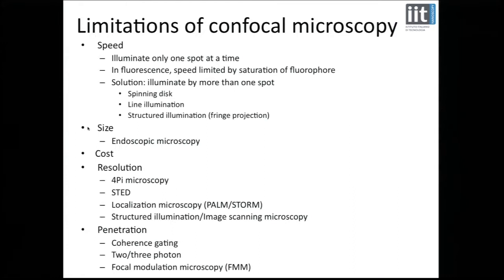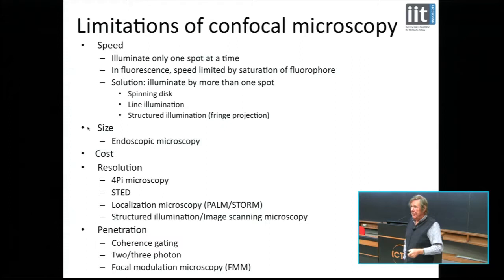Okay, right. So I think I've put over the impression that the confocal microscope is great. It does a lot of good for you. Certainly that must be true. Otherwise, they wouldn't have sold tens of thousands of these. But it still does have some limitations. And I've listed these in some detail here.